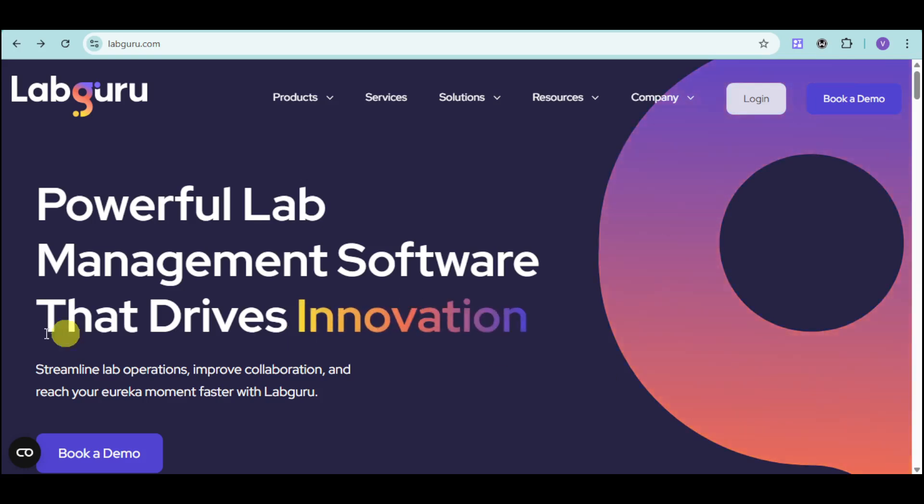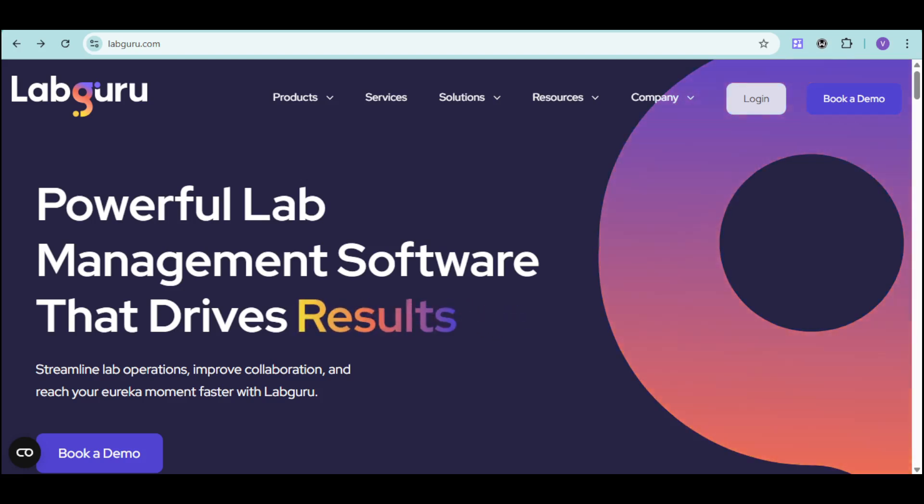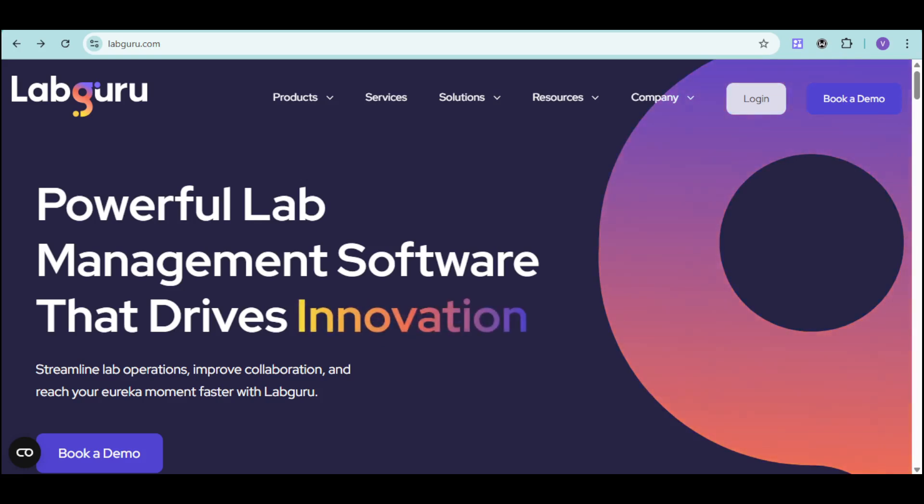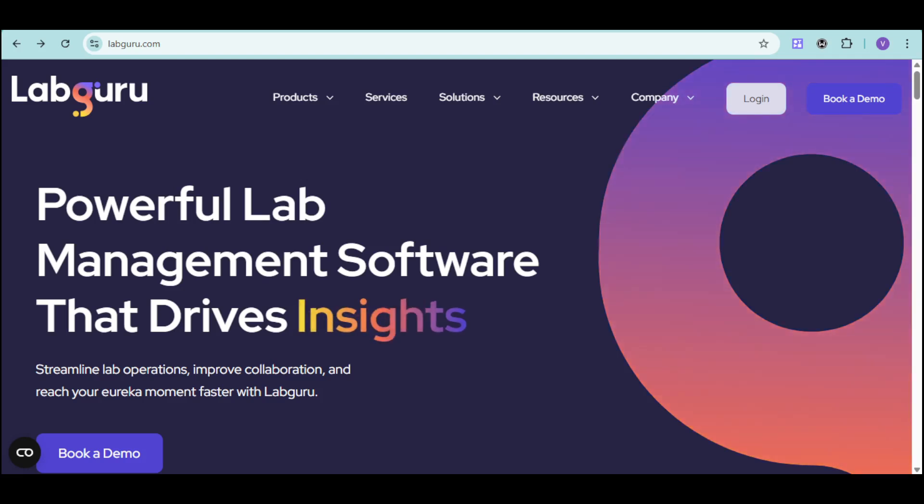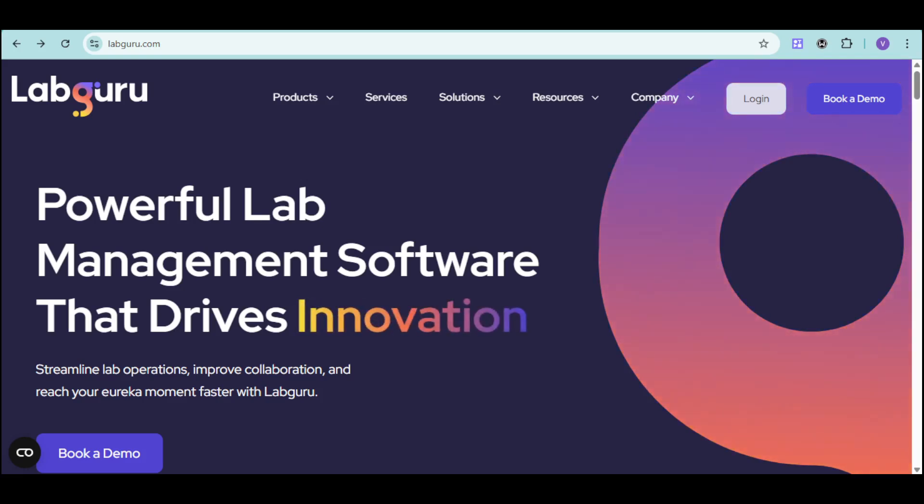It's time to discover LabGuru. LabGuru is the ultimate laboratory management software and data management solution that integrates an electronic lab notebook, LMS, inventory management, automation, and informatics into one easy-to-use platform.